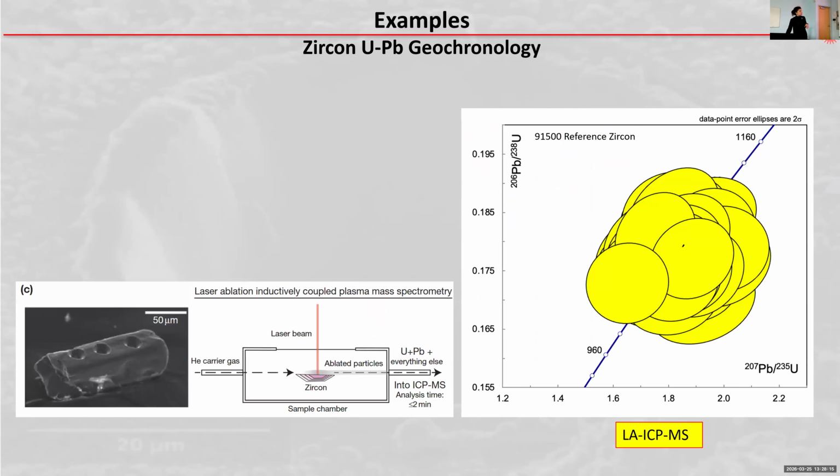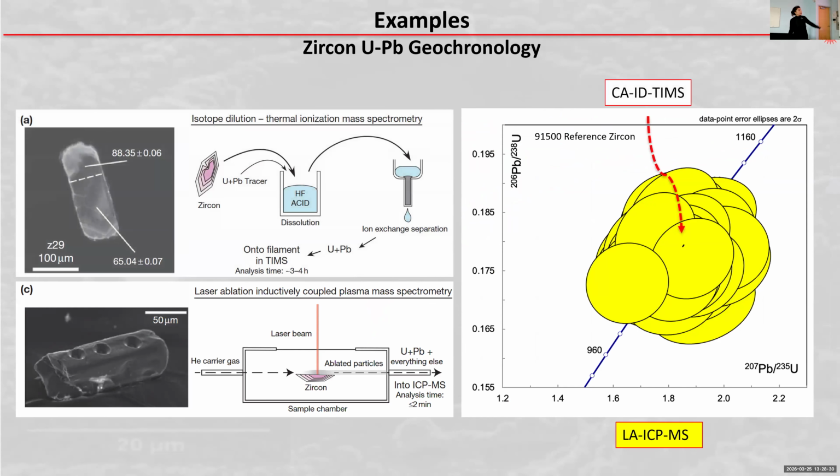And this is actually, I want to say, the Achilles heel of laser ablation ICP-MS, but that's the limitation, where the laser ICP-MS data for geochronology, for instance, have an error that is absolutely not comparable to an exact method, like using a thermal ionization mass spectrometer. That is an order of magnitude smaller in uncertainty than laser ablation ICP-MS can provide.